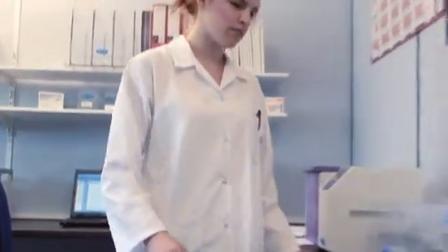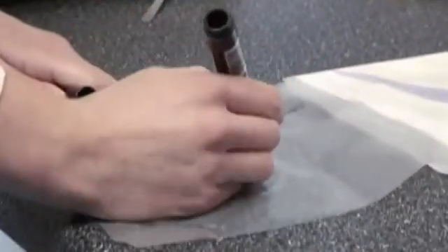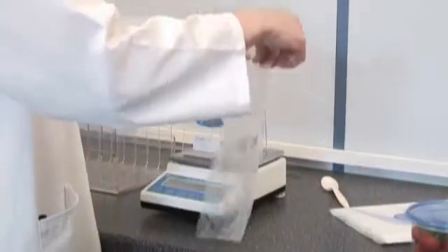The Stomacher is the leading laboratory blender available in the market, globally referenced for thousands of protocols within the food industry.